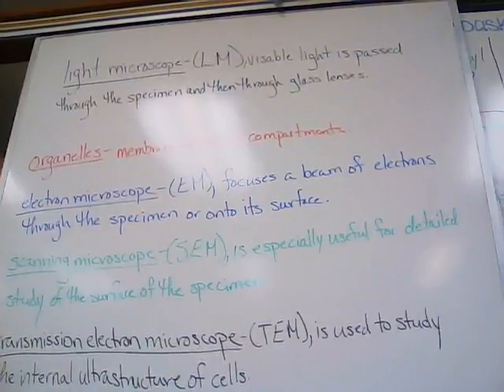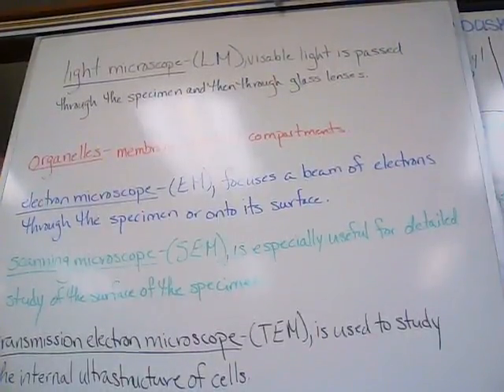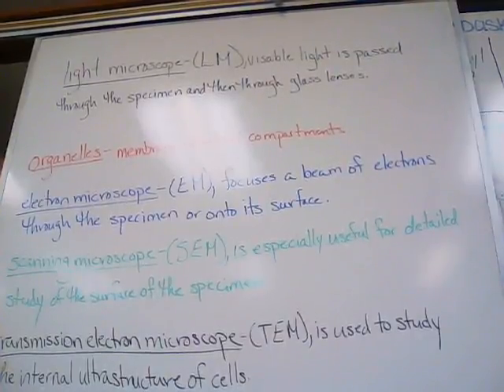Just as the resolving power of the human eye is limited, the light microscope cannot resolve detail finer than about 0.2 micrometer or 200 nanometers, the size of a small bacterium, regardless of the magnification factor. This resolution is limited by the shortest wavelength of light used to illuminate the specimen. Light microscopes can magnify effectively to about 1,000 times the actual size of the specimen. At greater magnifications, additional details cannot be seen clearly.